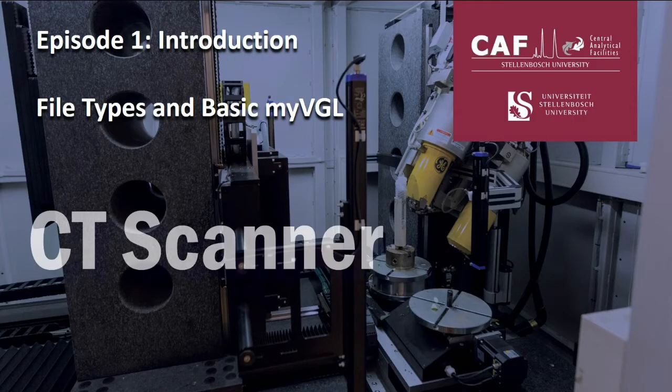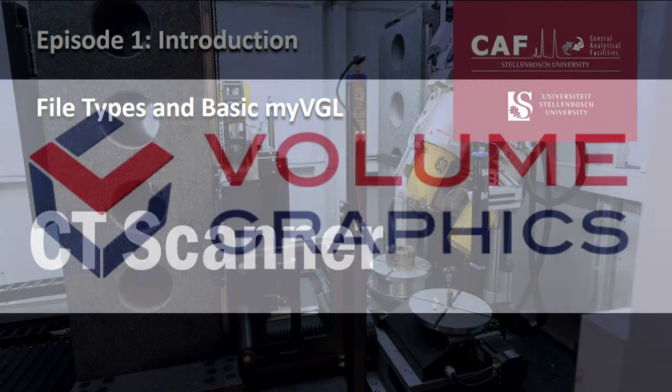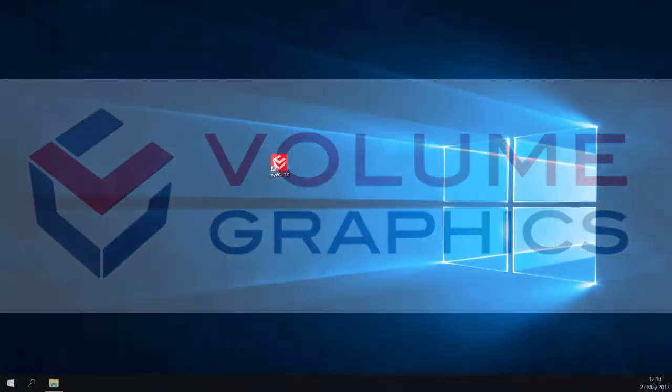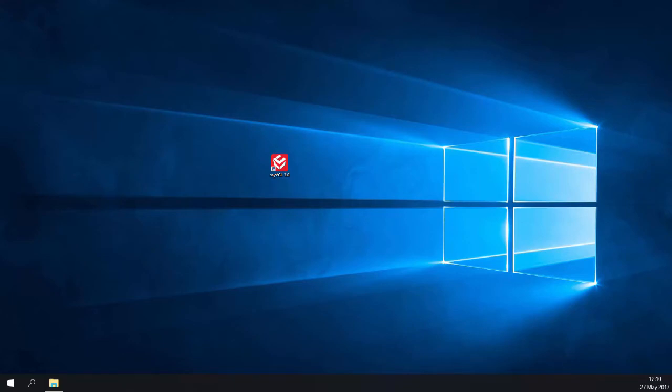This video is the first in a range of videos to guide you through the fun but sometimes complex world of X-ray CT analysis. In this first video, we will focus on showing you what to expect when you first receive your CT data and how to extract the important information you may require for your research. In this video, we will explore all the data and files you will receive from us when you perform scans here and how to use them to get all the info you need.